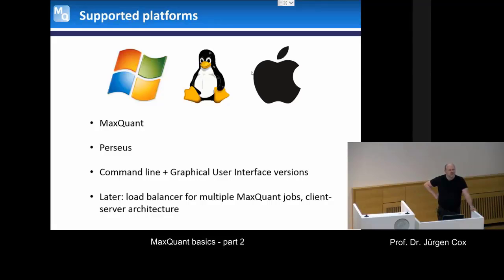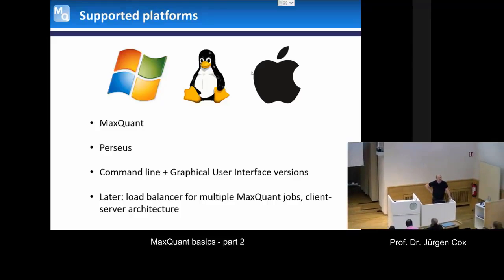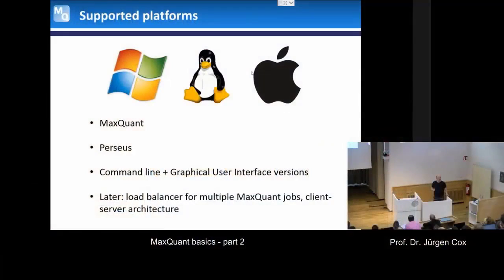Thanks. So sorry, I didn't quite get that. Is there going to be a graphical Perseus interface for Linux as well? Yeah, it's going there. This is actually working theoretically already. It's just that when we started it, we found that many things are not properly implemented in Mono. So it still requires some extra work to program around some problems that are still there. But we're doing this, and it will be there in a couple of weeks.